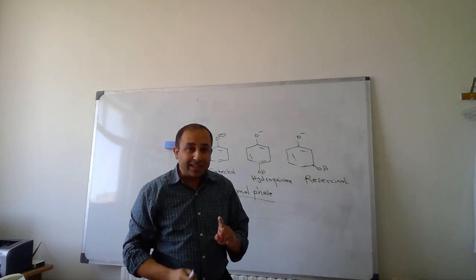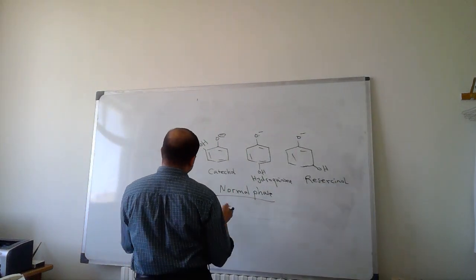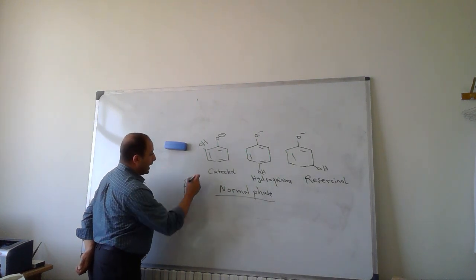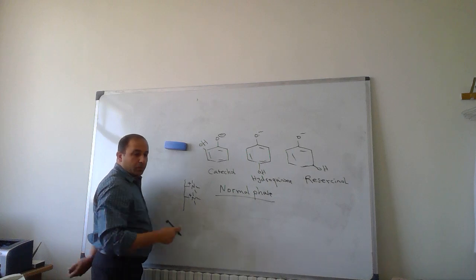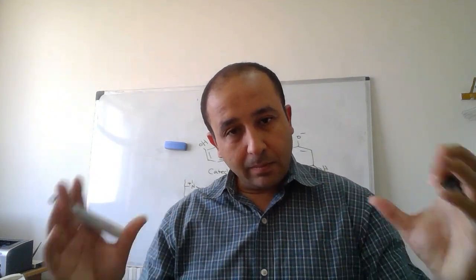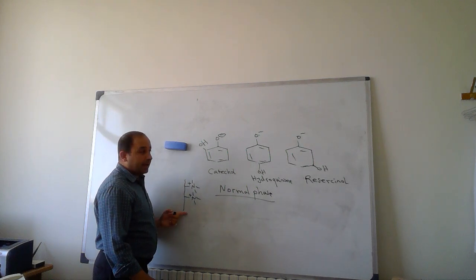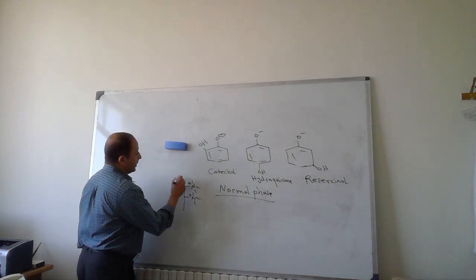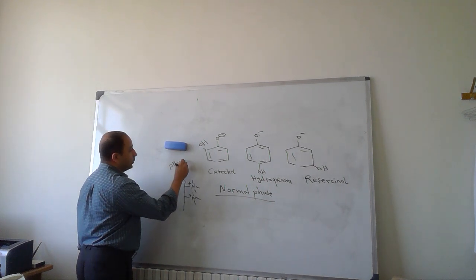If we are talking about silica-based ion exchange, what do we mean? We have silica and we modify it with some compounds to have a positive charge. We have silanol, then we add certain compounds to silica so that it possesses a positive charge. Now, silica can act as a surface for anion exchange. The problem is that the pH with silica shouldn't exceed 8, ranging from 2 to 8.